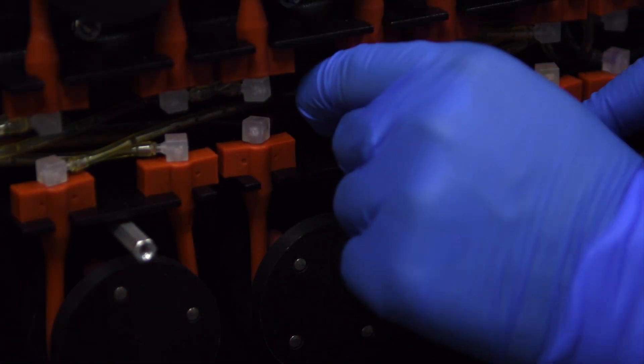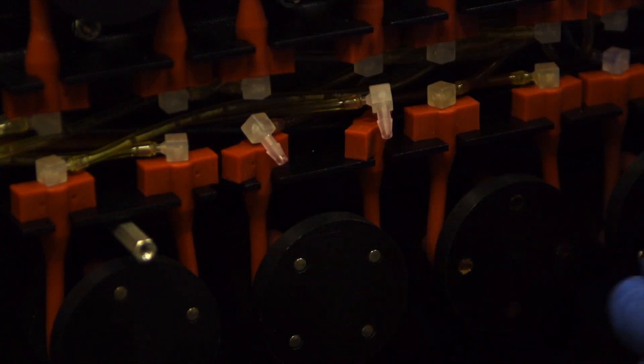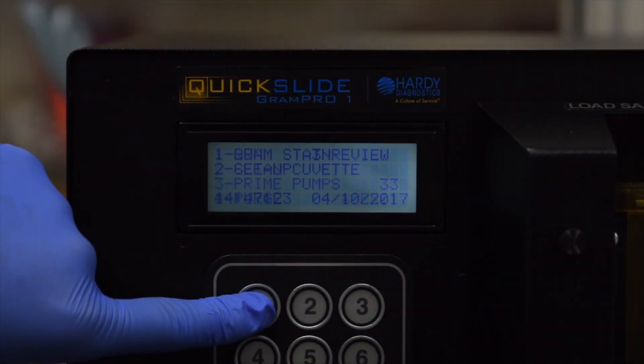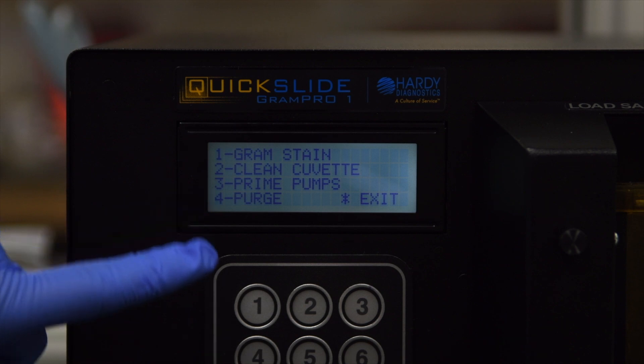In order for the machine to continue functioning as it is intended, a maintenance schedule needs to be implemented for your machine. This schedule is dependent on how many slides your lab processes each day.